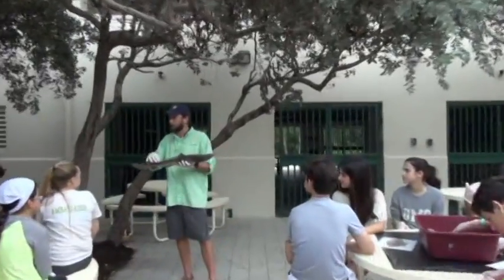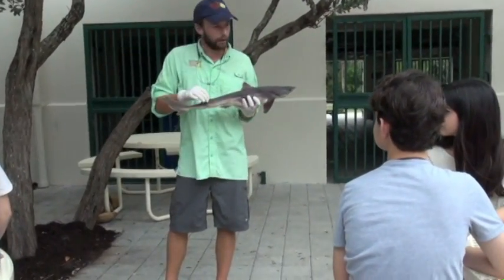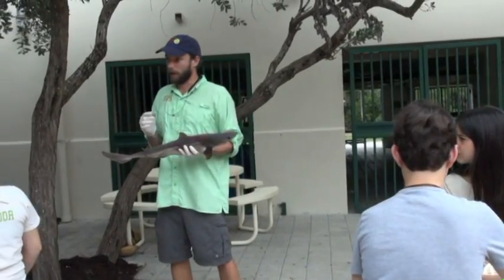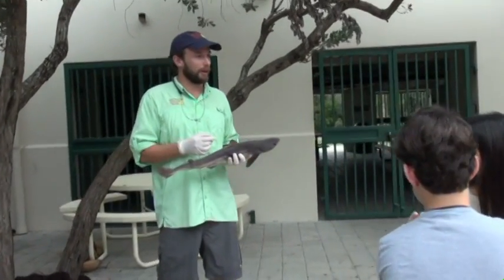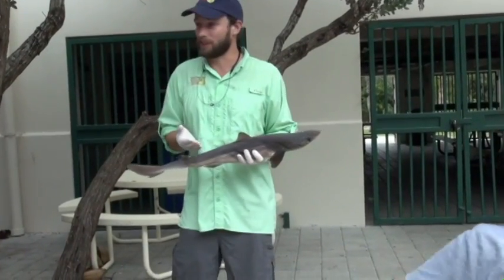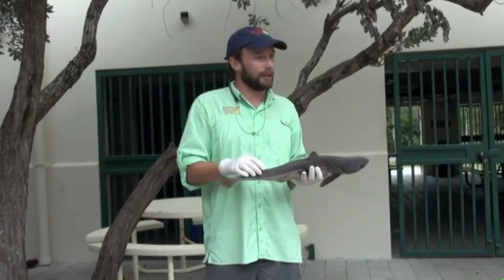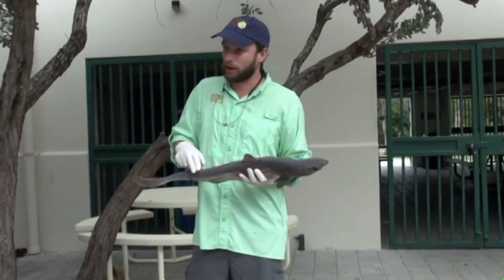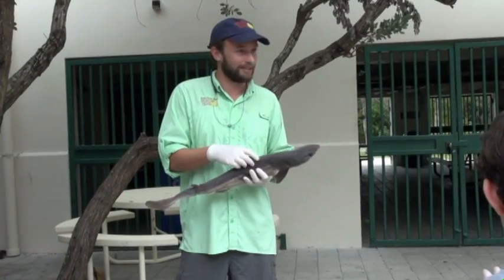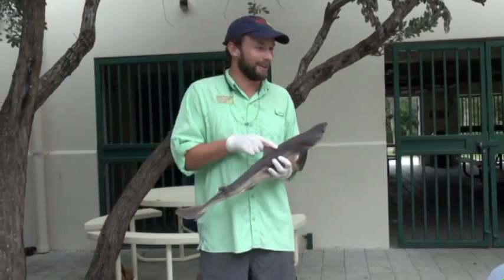Hard. Right in front of the dorsal fins, you're gonna see this hard little piece there. It used to be a big spine, a big venomous spine. What happens when you stab yourself with a venomous spine? Well, you don't die, but it does hurt. It doesn't feel good. It's like getting stung by a bee on steroids. So, what they did before we got these for dissection, they clipped the venomous spine off. I'm not 100% confident that you couldn't find a way to stab yourself on it still, so do look at it, squeeze it from the sides, but don't push your finger hard on it, all right?